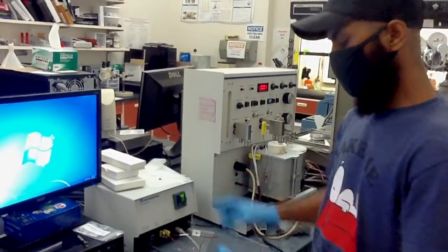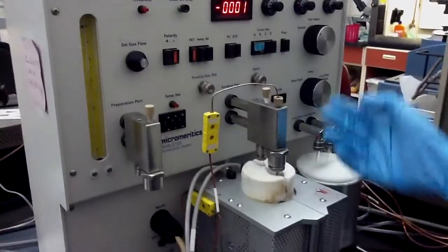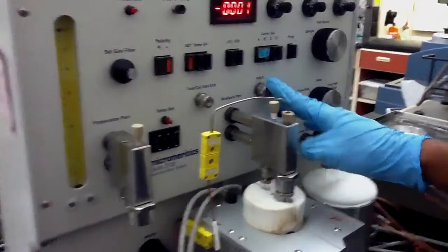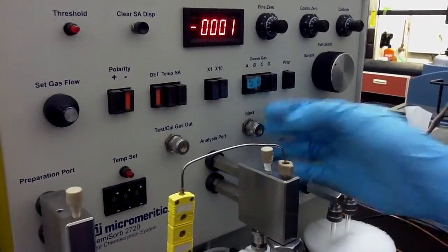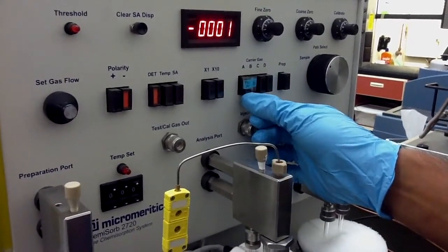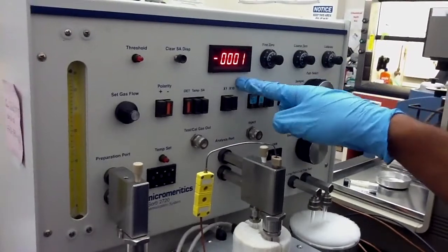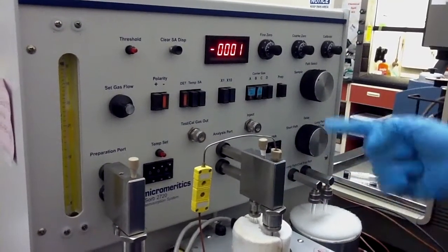Now we will set up our experiment to read out the sample. When we want to analyze our sample, we have to change the gas from preparation gas to analyzing gas, which is here hydrogen on argon mixture. For this one, we will be running hydrogen TPR, so we will be using hydrogen on argon. In this case, you also have to wait until this whole reading gets stabilized once again, because we change the gas, TCD will read the reading once again.